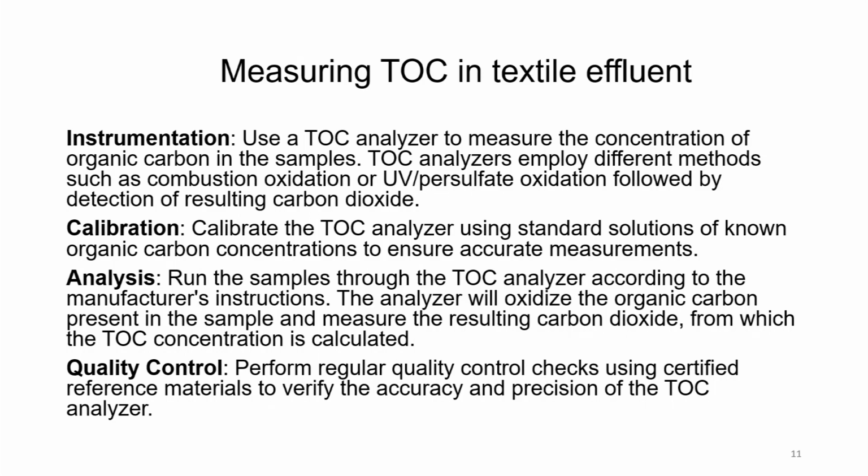Quality control: perform regular quality control checks using certified reference materials to verify the accuracy and precision of the TOC analyzer. So, as I told, each of these equipments has to be calibrated time and again, periodically, so that they give precise results.